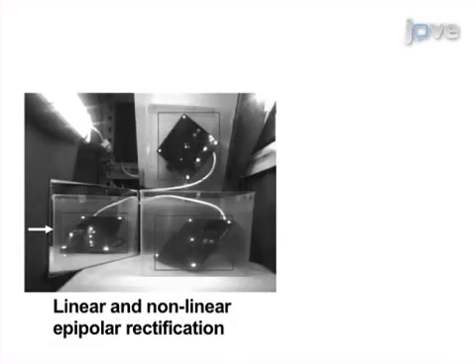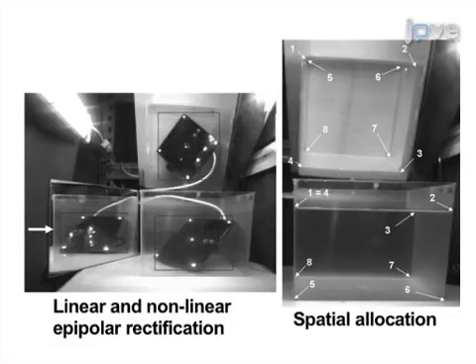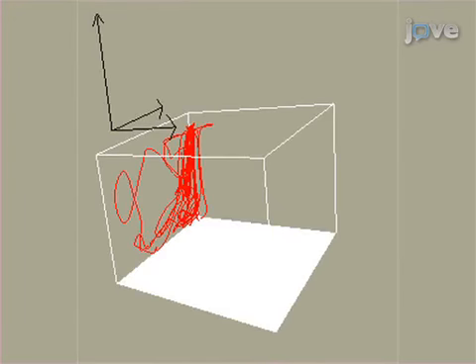This is accomplished by first calibrating the system, which also corrects for the sizable image distortion generated by refraction. The second step is to record video frames at relatively high temporal resolution from at least 2 different angles simultaneously. Next, the software reconstructs the trajectories of the fish.